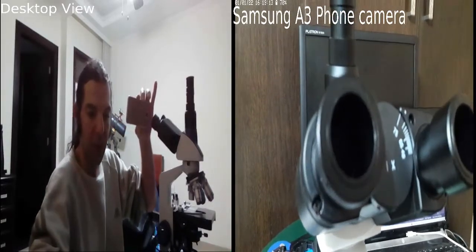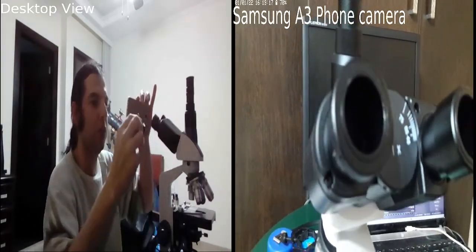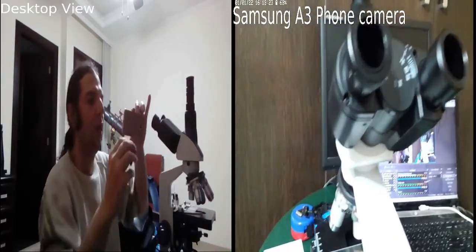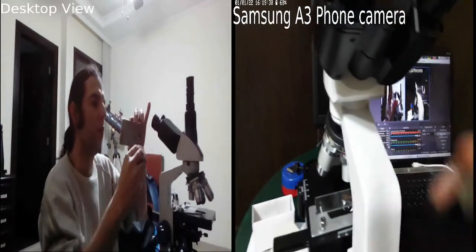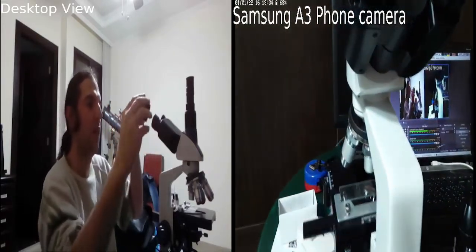So what I do, like I told you, is use this adapter. Let me show you it from this view. This adapter, I will find you one from the links of AliExpress, so you can try to find something similar to it and buy one.